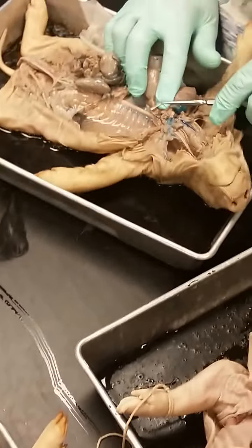You can also see little red and blue and white threads that seem to be going out between the ribs. These are intercostal arteries, intercostal veins, and intercostal nerves. However, I do not have those on the list, so I will not ask you those on the exam. You got that? But at least I'm trying to point them out to you. Questions about this? Let me go back to this.